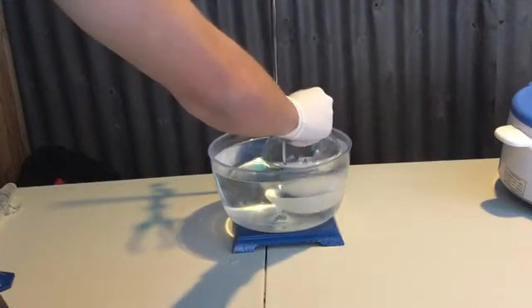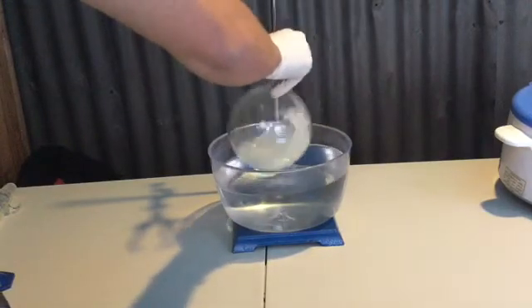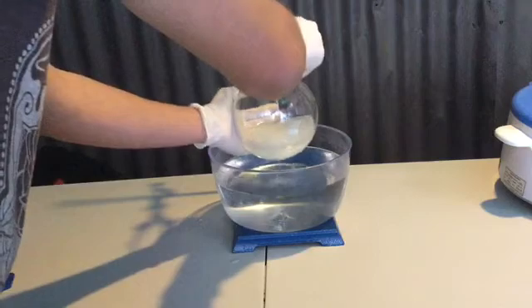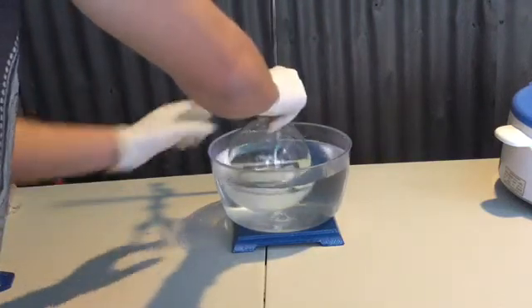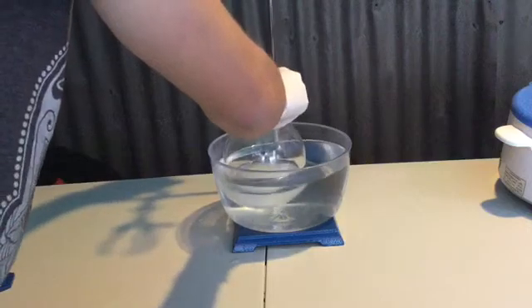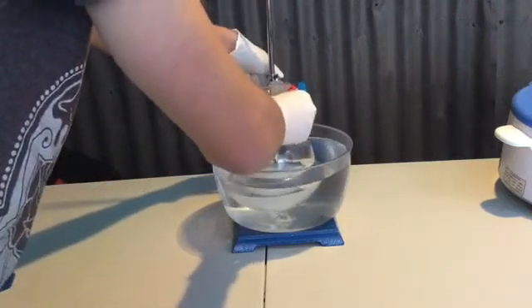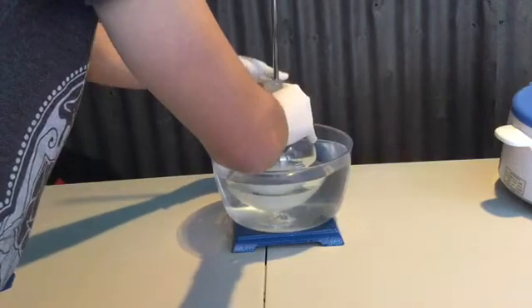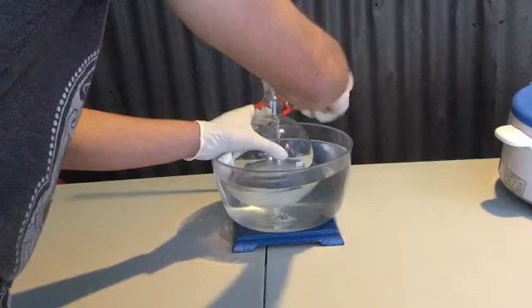The flask was gently shaken to mix the solution, and then it was placed in cool water to help control the temperature. This was done several times. I'm touching around the bottom of the flask to get an idea of what the temperature is — it was very hot. The flask was then placed in the water bath permanently for a small amount of time to reduce the temperature a little bit before heating.